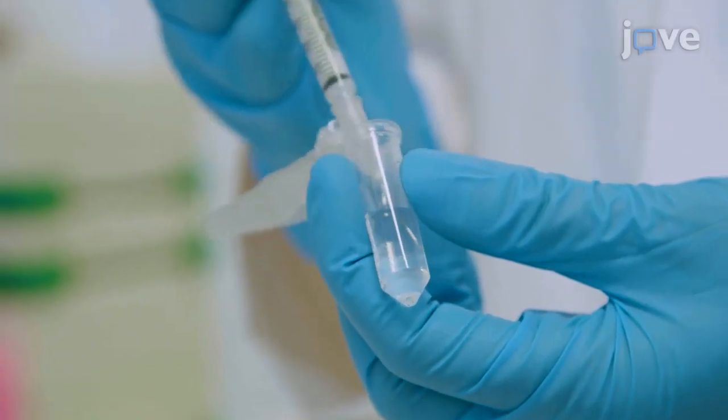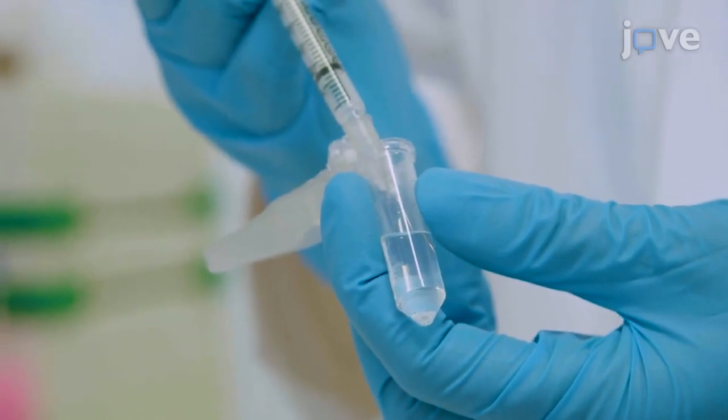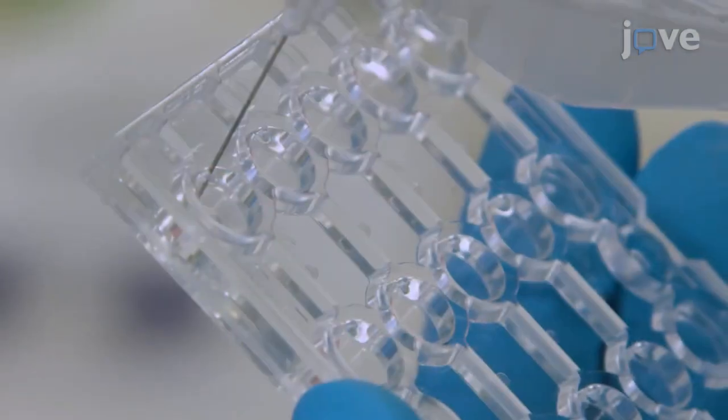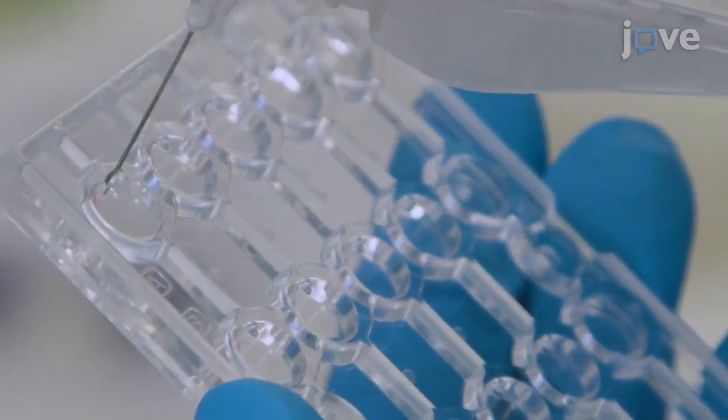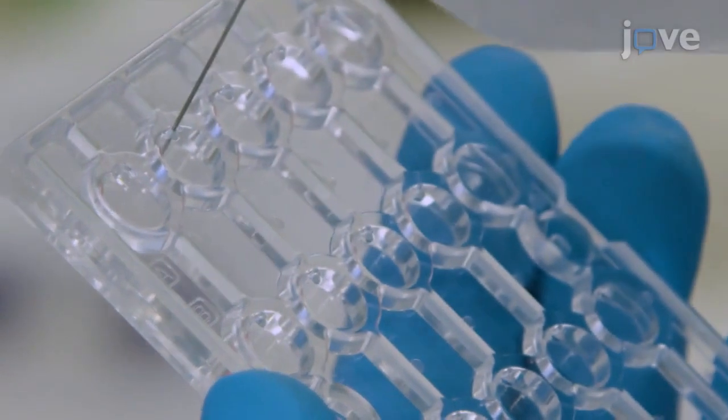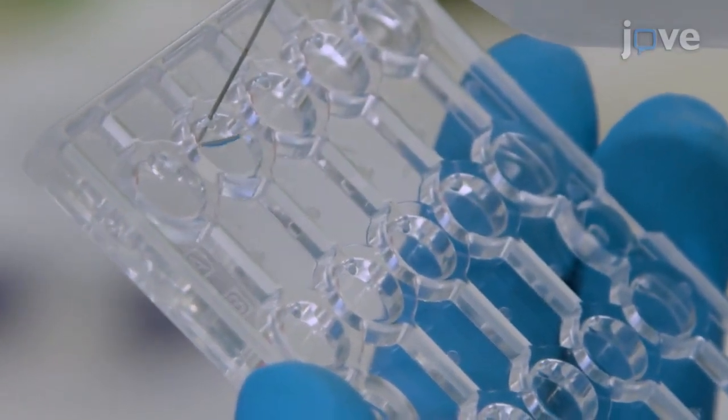The in-situ chemotaxis assay, or ISCA in short, is a flexible, user-friendly, and simple device that allows new insight into microbial behaviors and therefore the role and function of microorganisms in any environment that has a liquid phase.